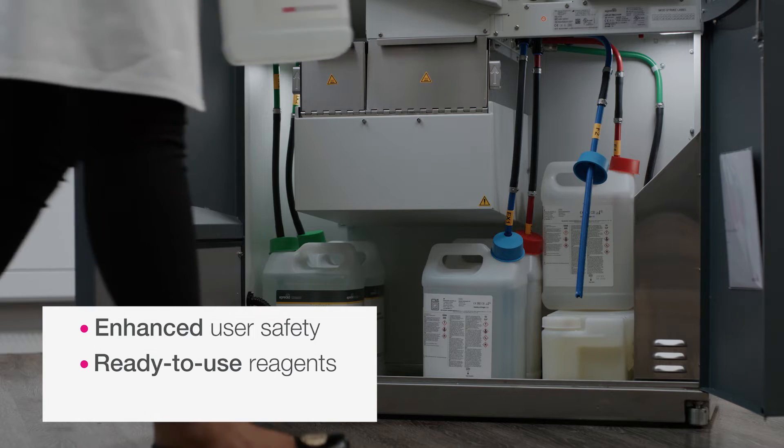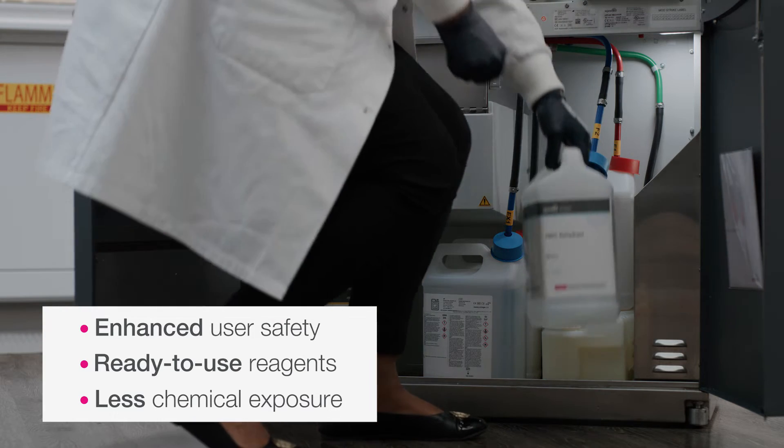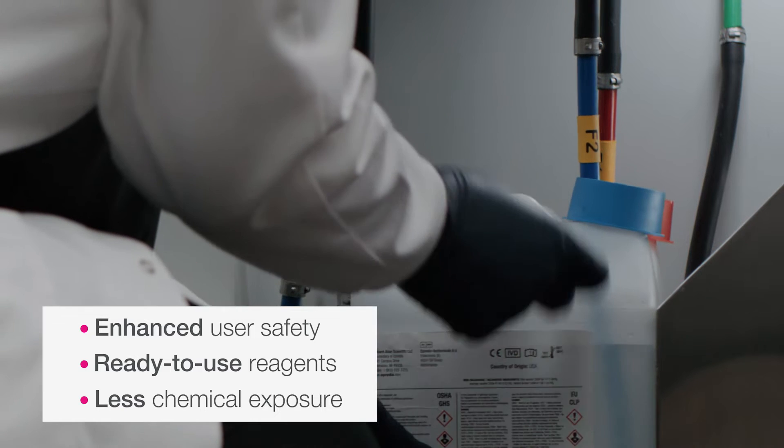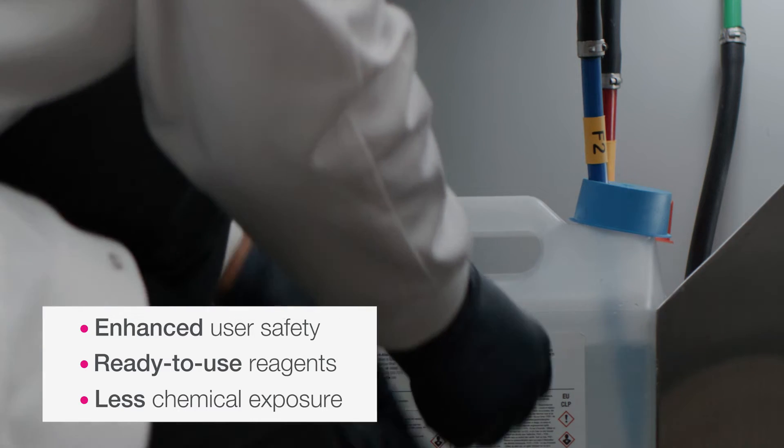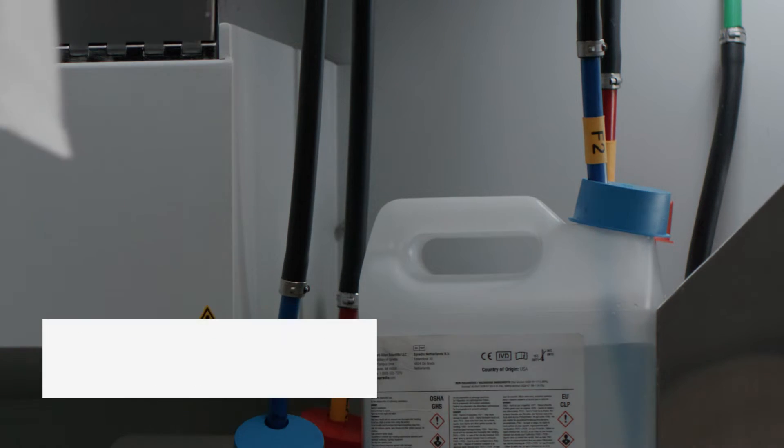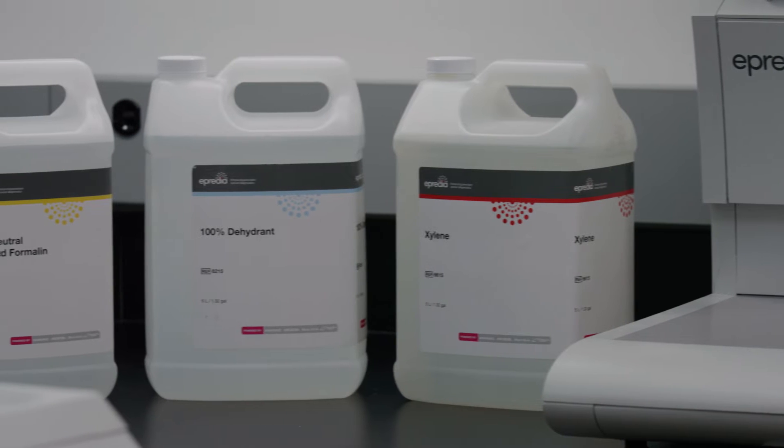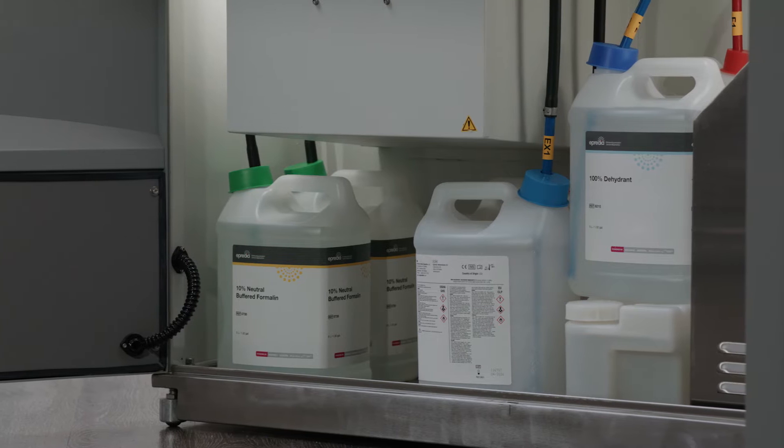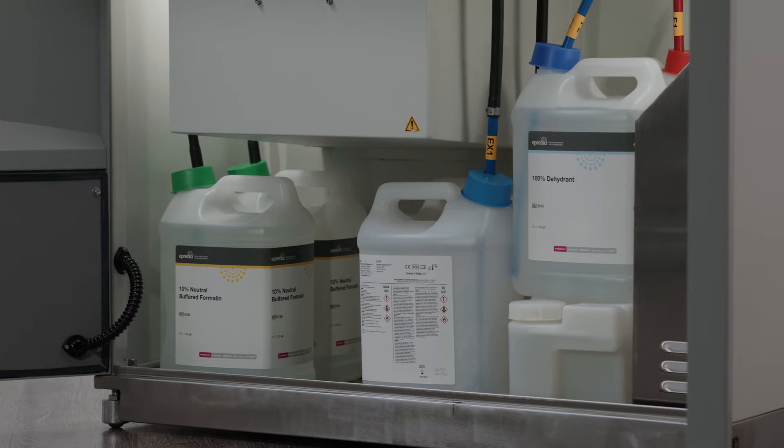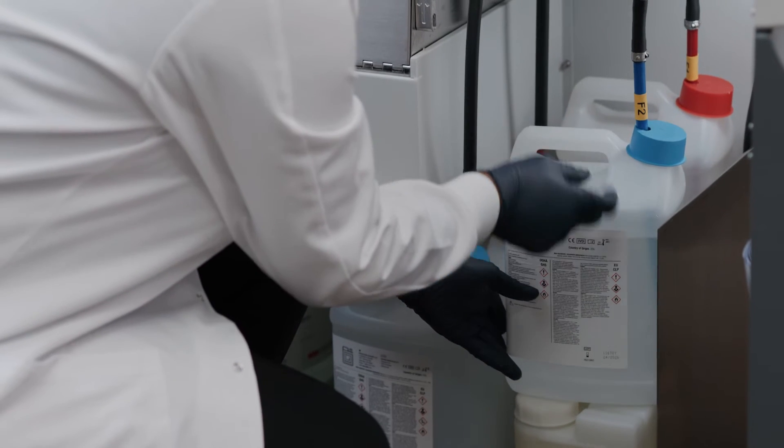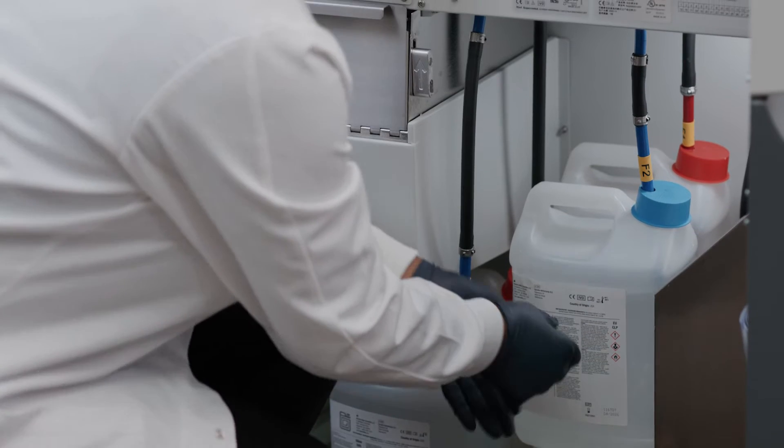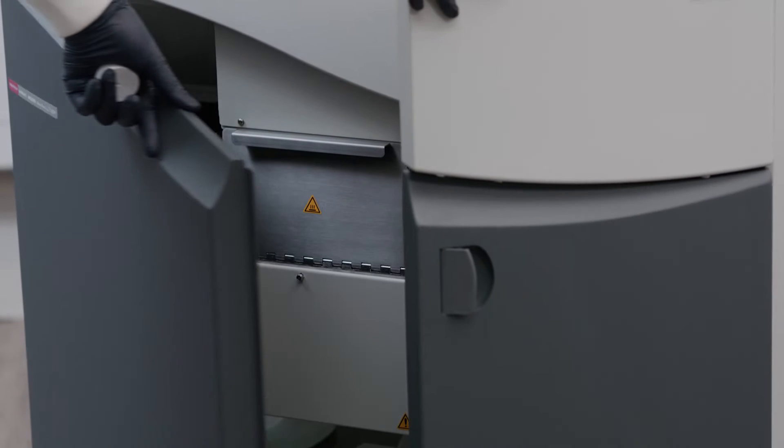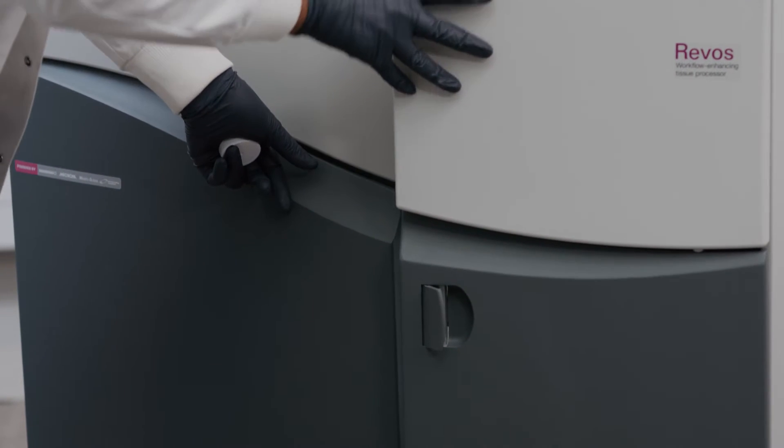Changing reagents can be a tedious and time-consuming part of the tissue processing workflow, but with the Revos Tissue Processing System, this becomes fast and straightforward. Apredia offers a complete line of plug-and-play reagents designed for the Revos system, providing ease of use and conveniently eliminating the need to decant. This promotes a safer environment while saving you reagent exchange time, minimizing spills, and decreasing your lab's chemical exposure.